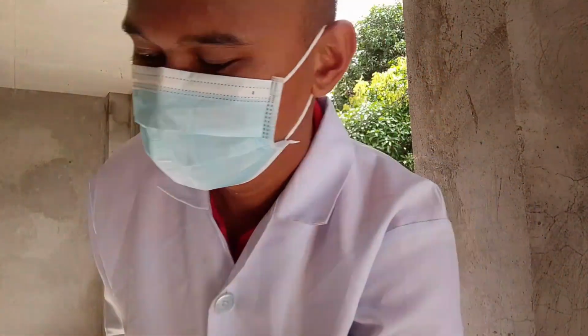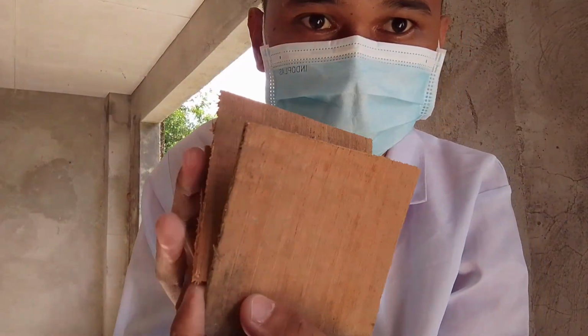I will now proceed to identifying and comparing the different types of toolmarks such as negative impression, abrasion or friction mark, and combination mark. For today's task, I will need a hammer, a screwdriver, and 3 plywoods.